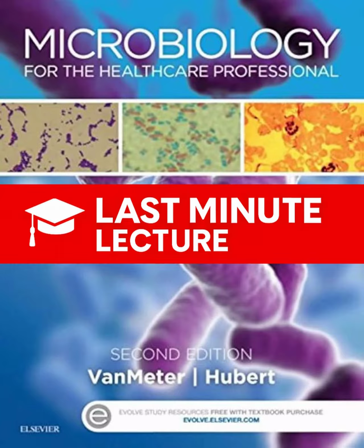Useful for really specific research. But much more common, especially in clinical labs, is complex media. This has at least one ingredient, like peptone or beef extract or yeast extract, where you don't know the exact chemical composition. It varies a bit. It's generally richer, supports a wider range of microbes, and it's usually easier and cheaper to make.